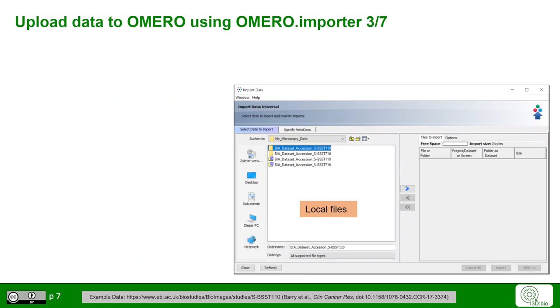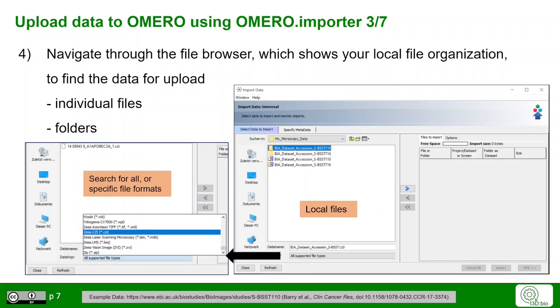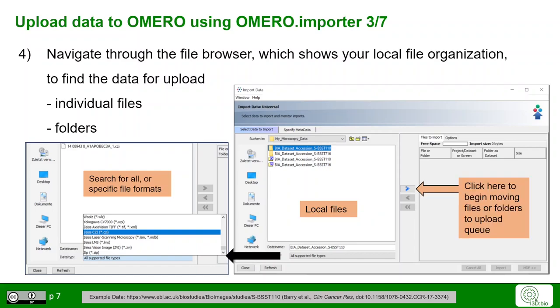To import data, you can search for files in your local files on the computer. Navigate through the file browser and choose either individual files or whole folders for upload. You can also restrict the search by looking for only specific file types, for example only from Zeiss microscopes or others. Once finished, click on the arrow to begin moving the files or folders to the upload queue.